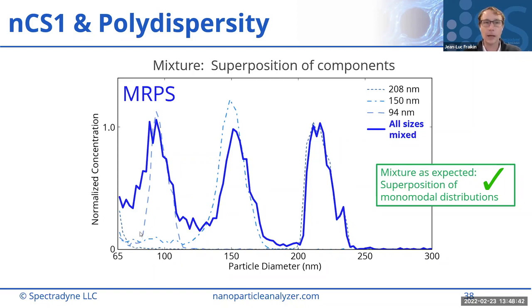So here, it's not affecting the data in any way because we're measuring the particles directly. We have features in our software that allow you to do a careful analysis very close to the noise floor and customize the acceptance criteria for whether particles are real or not down there. Does that answer your question? It does. Thank you so much.